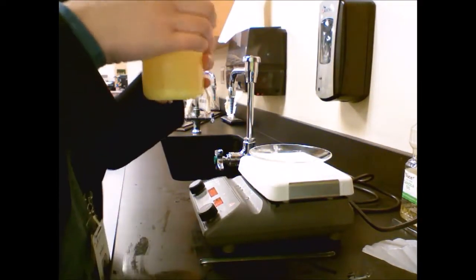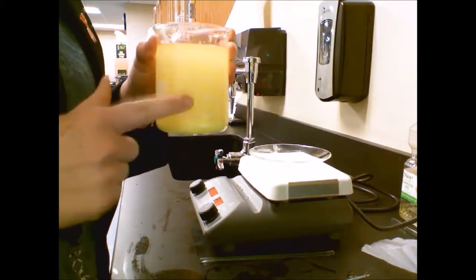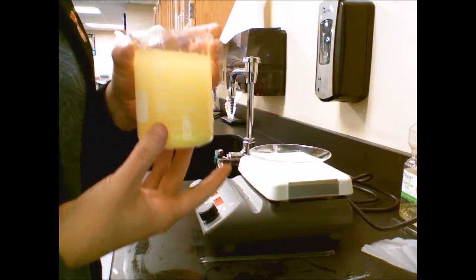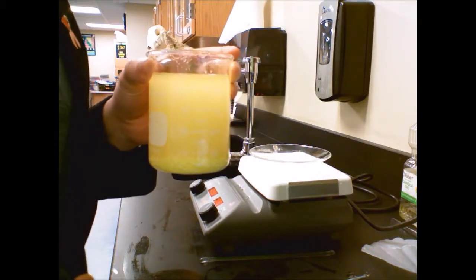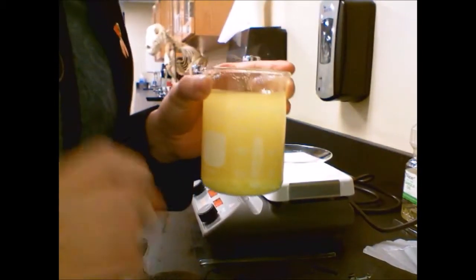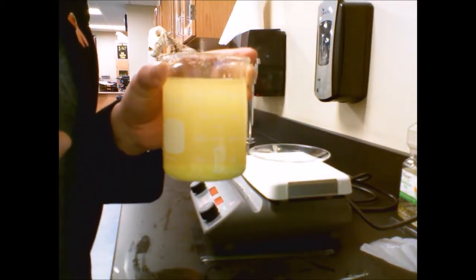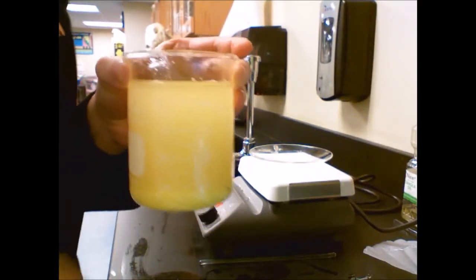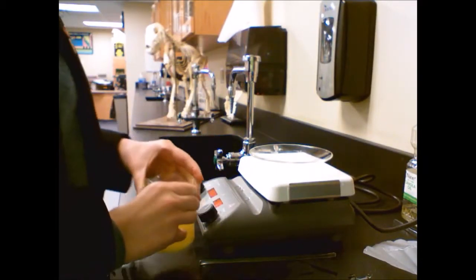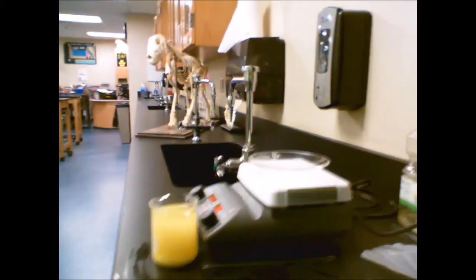And in the meantime, this, because it is cloudy, needs to sit for a mite bit to allow all the particulates that are in the solution currently to settle to the bottom. If I do not do that, each of those little particulates will serve as a nucleation point for another crystal. So we end up with a ton of very tiny crystals rather than some nice large ones. To give you an idea of what a large one of these crystals looks like, I have my 2 largest crystals I have grown thus far.